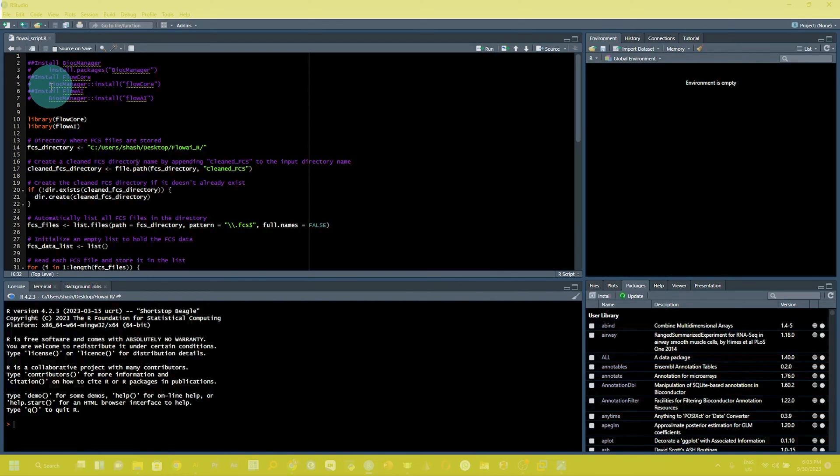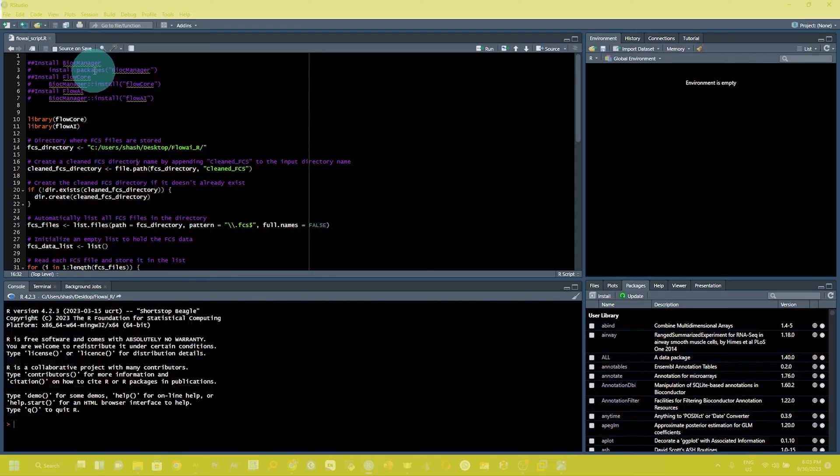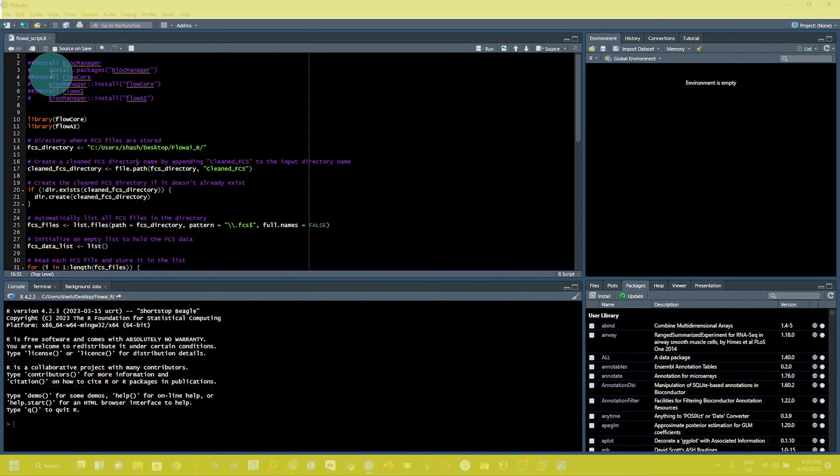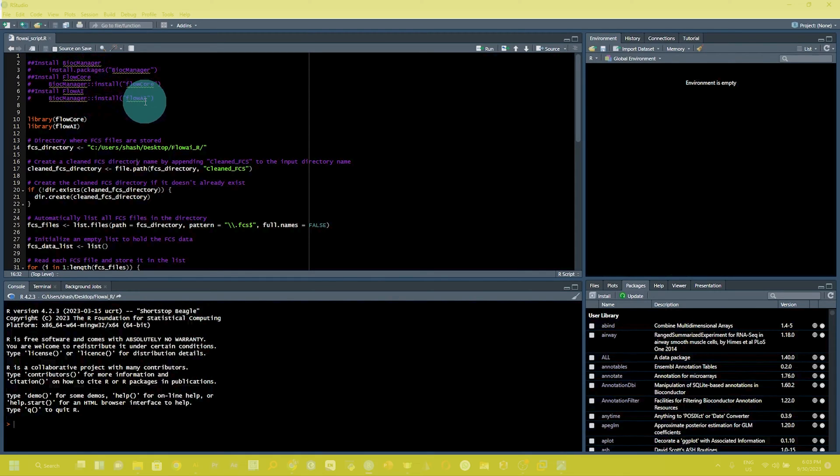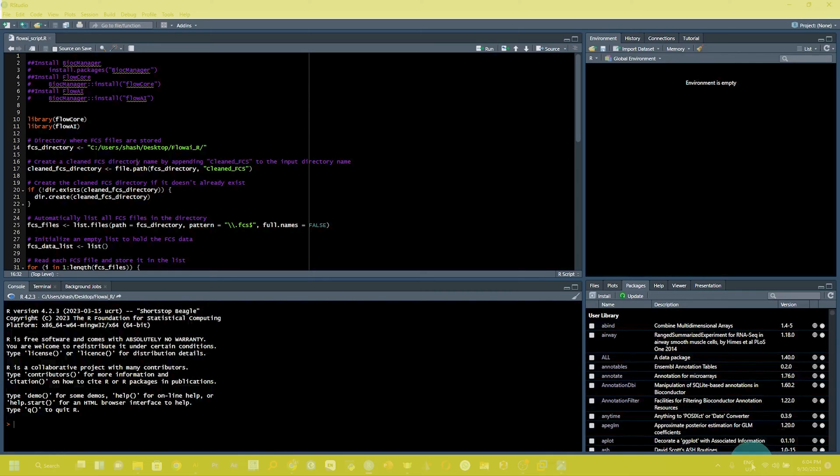You need to install certain R packages in your library like BiocManager, flowCore, and flowai. You can install them by the provided command here, but be sure your system is connected with an active internet connection during the installation of these packages.